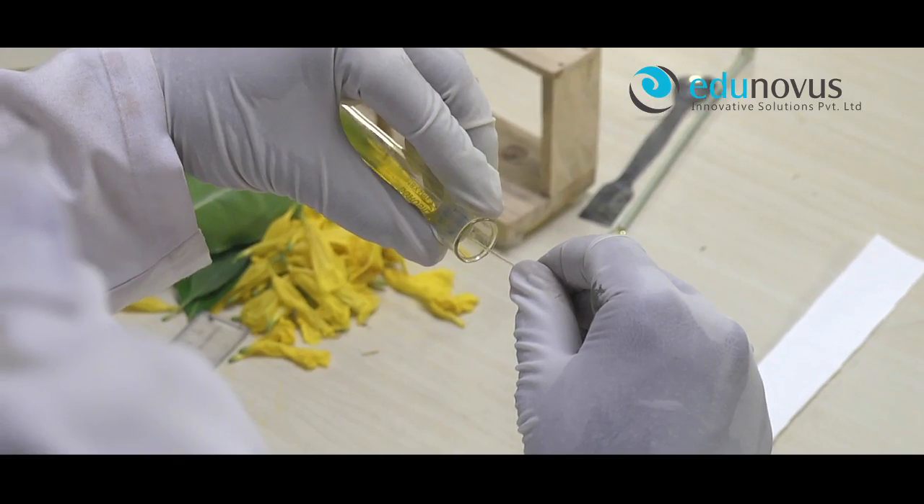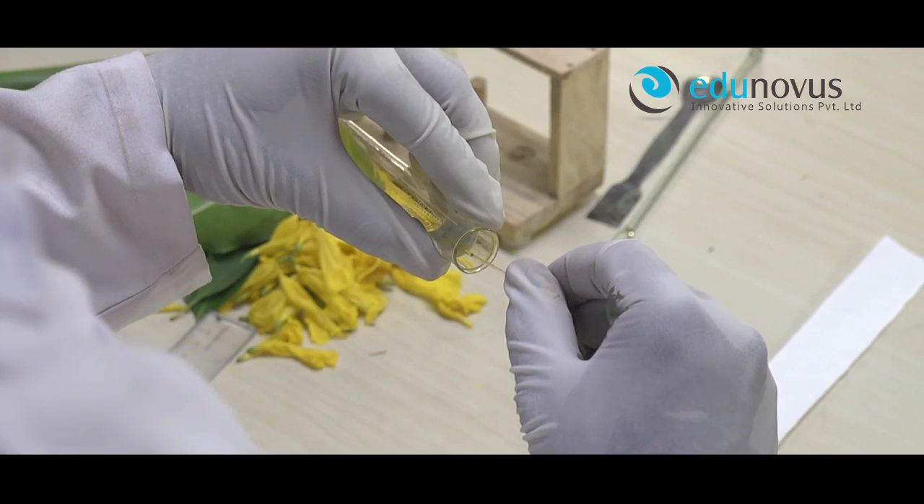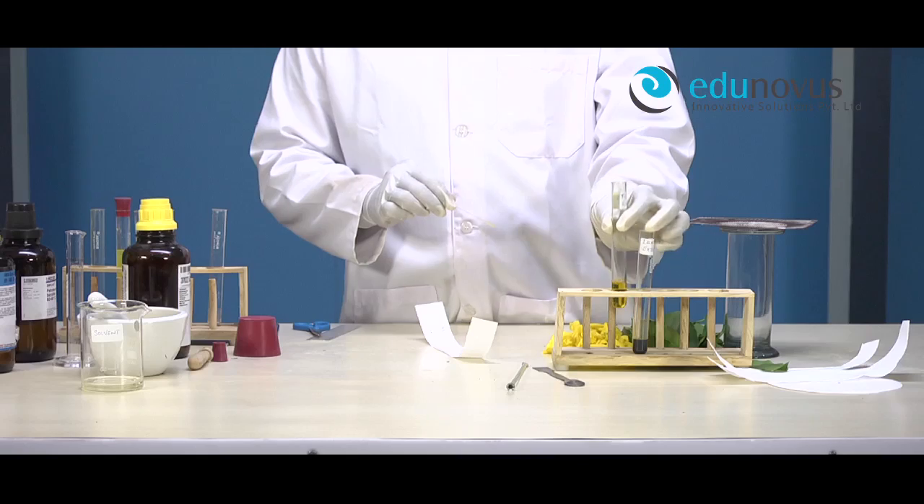Now, with the help of a fine capillary tube, put two drops of flower and leaf extract at points A and B respectively.